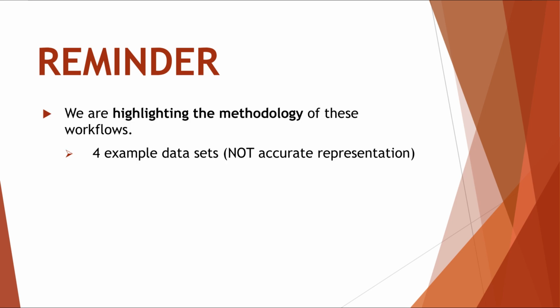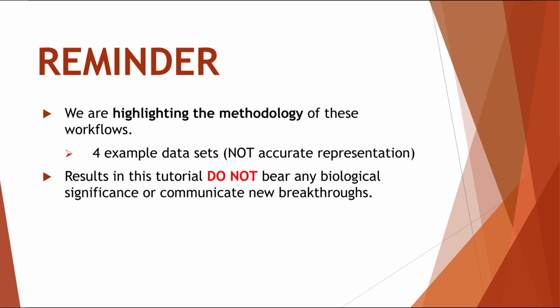Now that we have some results that go beyond the number of peptides and proteins, I want to reiterate again that this tutorial material is meant to highlight the effectiveness of our clinical metaproteomics workflow. We used a small example set of quantitative proteomics data from an ongoing study of ovarian cancer in fluid from cervical swabs. Because the sample data is so small, results in this tutorial are not meant to bear any sort of biological significance or communicate any new upcoming breakthroughs.